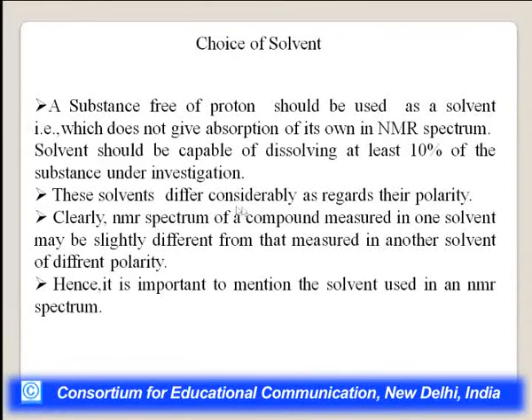These solvents differ considerably as regards their polarity. Clearly, the NMR spectrum of a compound measured in one solvent may be slightly different from that measured in another solvent because of different polarity. Hence, it is important to mention the solvent used when you are elucidating any NMR spectrum.